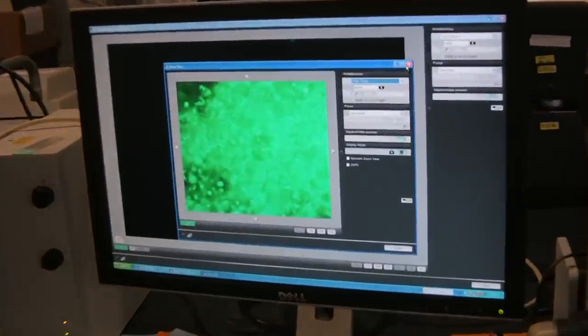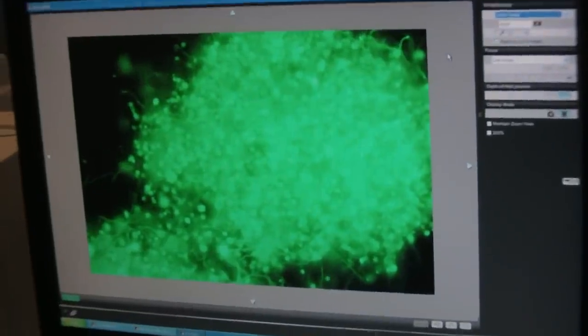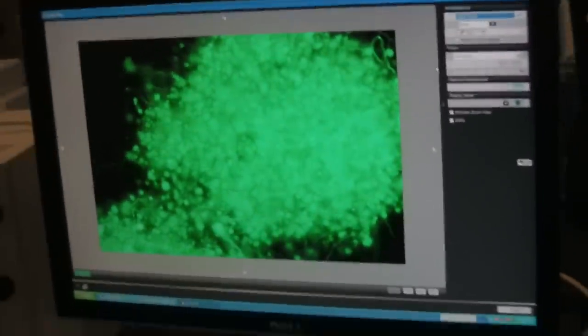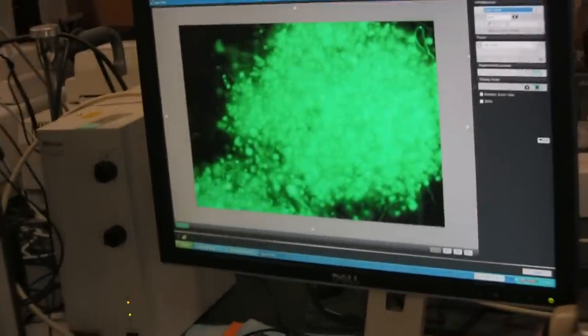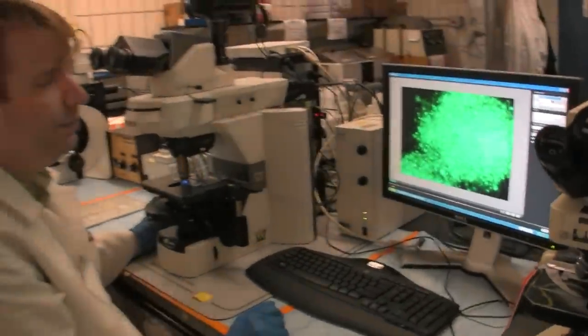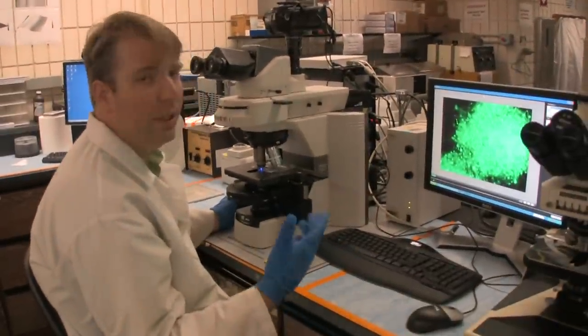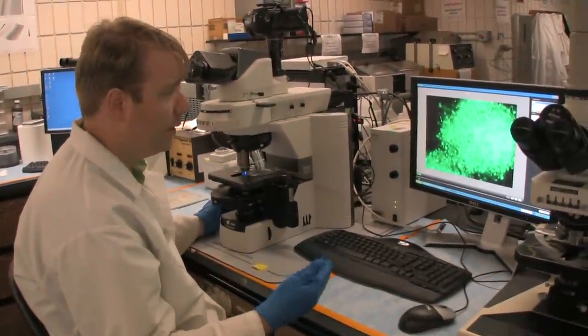They're saying this is incubated with elevated CO2. So this just forms inside the suspension, especially on the glass surfaces of the tube. We haven't done anything to trigger the biofilm formation. We haven't administered any compounds or tried to do any kind of treatment to get it. The biofilm forms even in a perfectly happy culture. It seems to be a matter of just the number of Borrelia that we have present; as the population starts to increase, we start to make them.